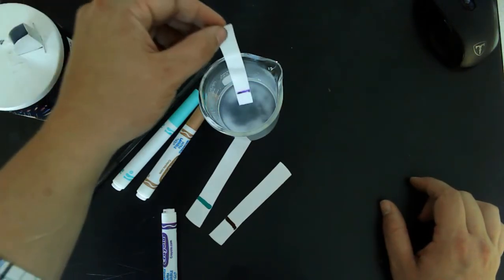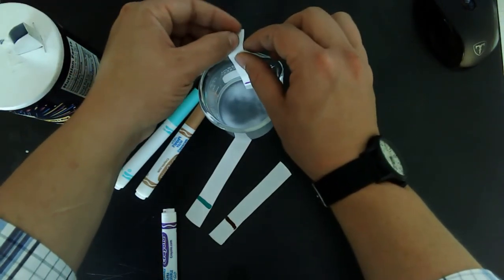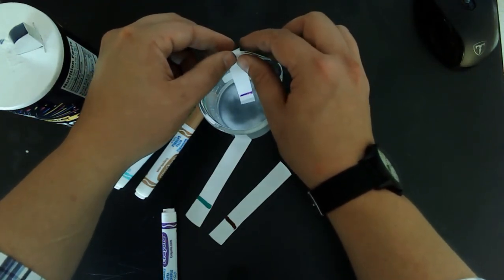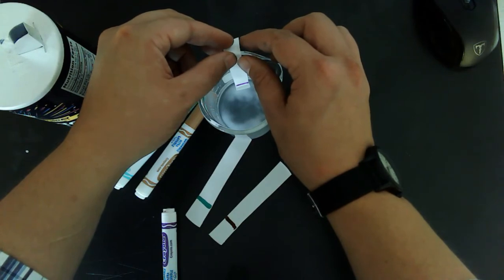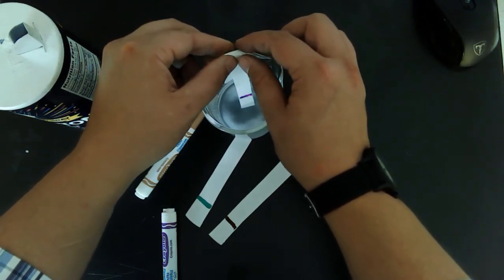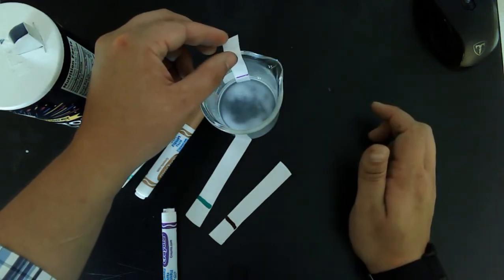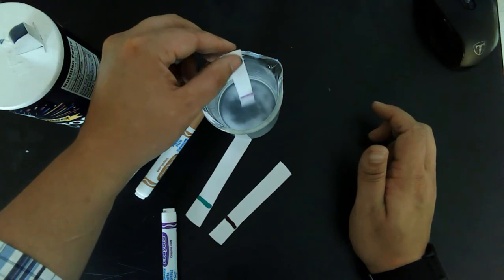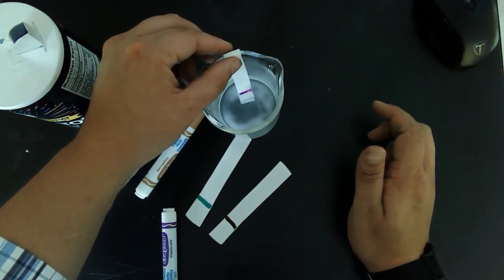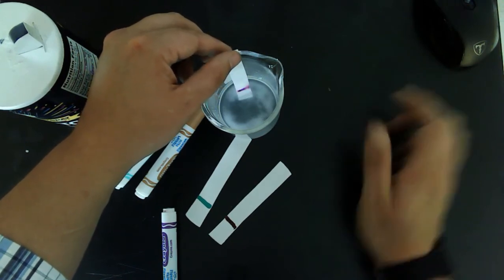So I'm going to go ahead and set those in there, and I'm going to fold it over on the side, that way my purple mixture doesn't get in my solution all the way. We don't want to go above that line. Okay. It takes a little bit of finesse to figure it out. We can see those layers already starting to separate on me.